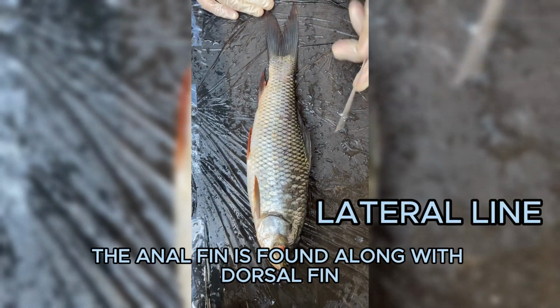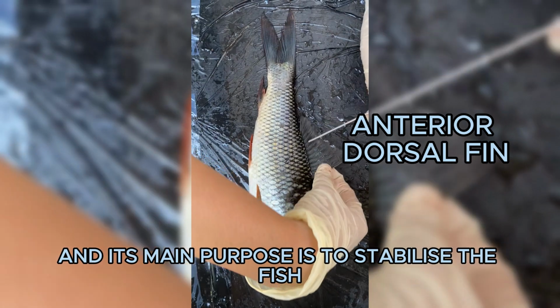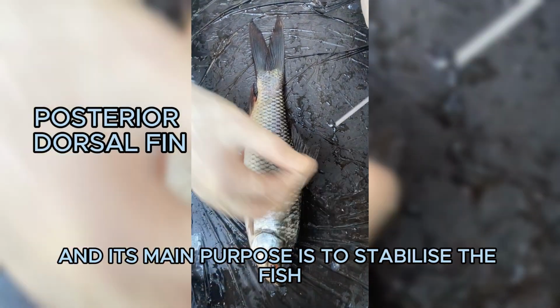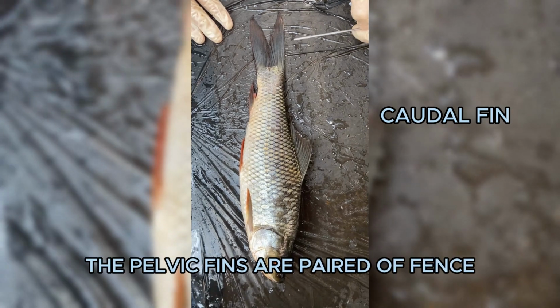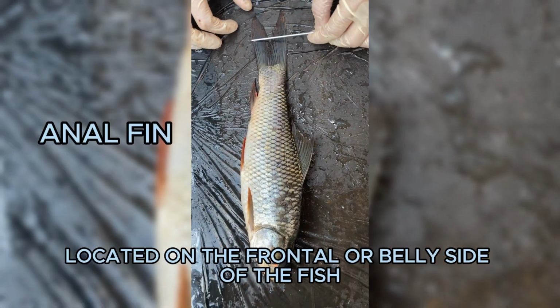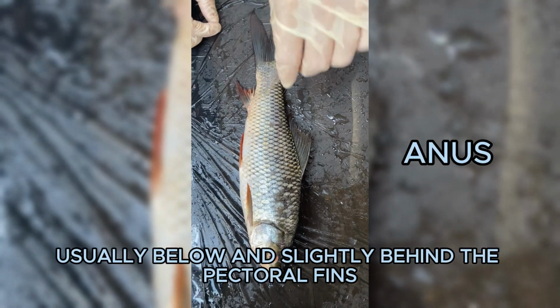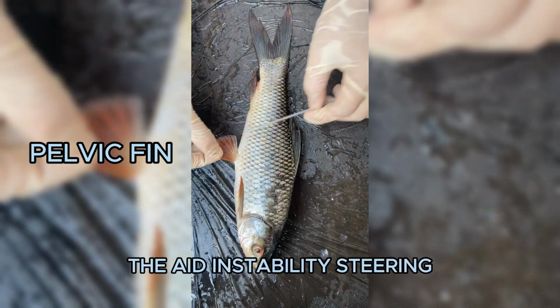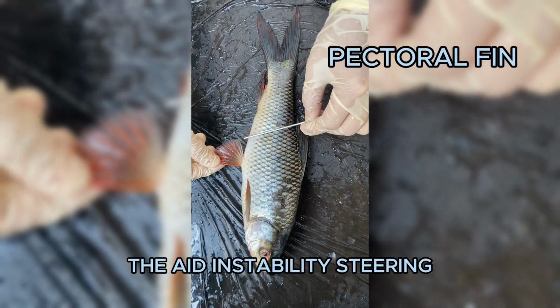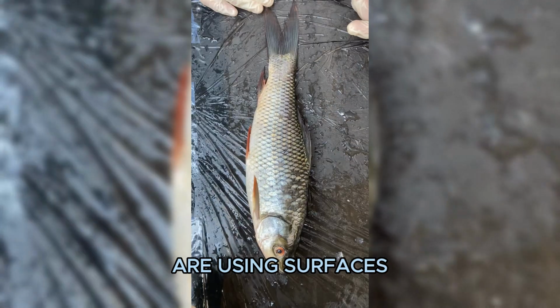The anal fin is found along with the dorsal fin, and its main purpose is to stabilize the fish and keep it upright in the water. The pelvic fins are paired fins located on the ventral or belly side of the fish, usually below and slightly behind the pectoral fins. They aid in stability, steering, and sometimes even in holding objects or gripping surfaces.